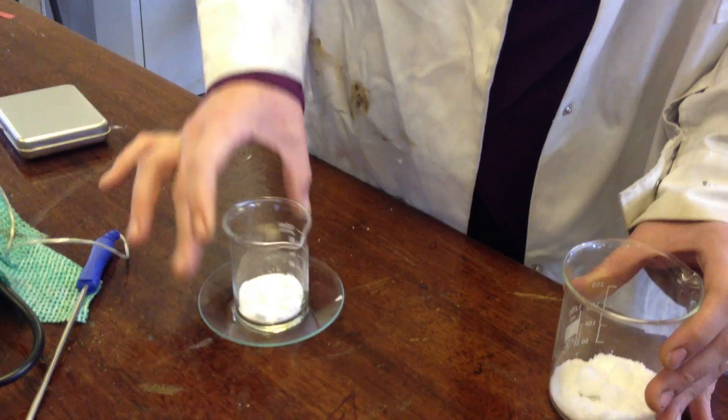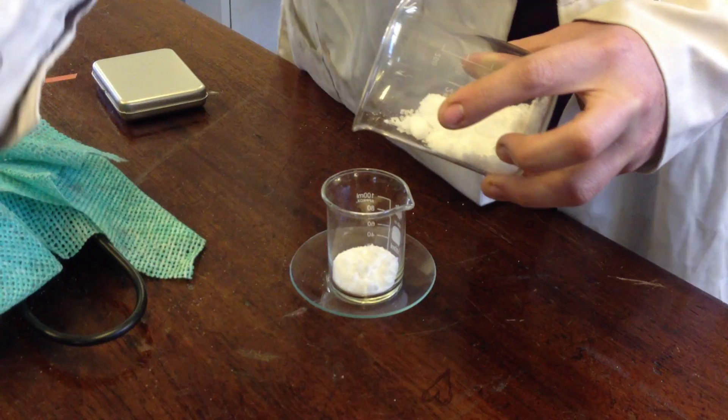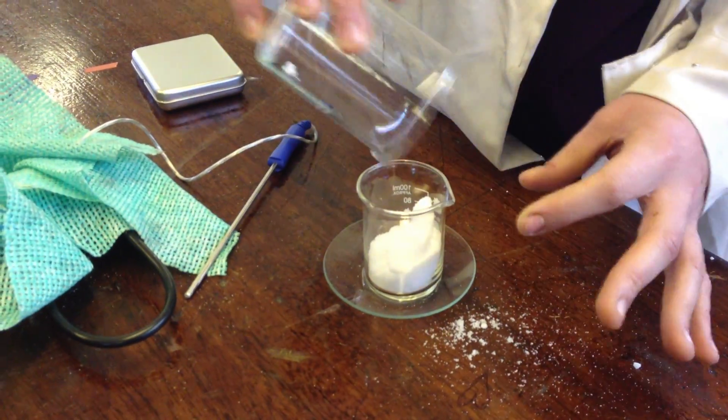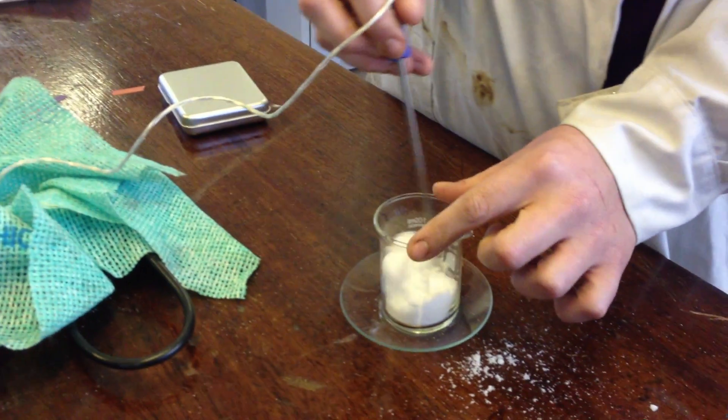I'm going to put that on top of the water just so we can see the effect, and I'm just going to put the temperature probe on. Now we've got two solids reacting together here and all I'm going to do is mix them together.